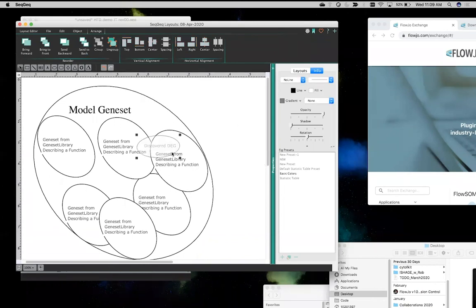And I want to point out that this guy is not going to typically sit just within one gene set, because that would be too handy. Instead, oftentimes these are not overlapping entirely one gene set. They might even overlap three, but I'm going to intentionally move this a little bit further to the right here. That's hard to make them overlap exactly three. Okay. So the idea being, because this gene set overlaps many gene sets from the library, perhaps we're going to have some probability that this gene set is actually coming from this process, and this process, but more likely coming from this process. So that's what gene set enrichment analysis is telling us.